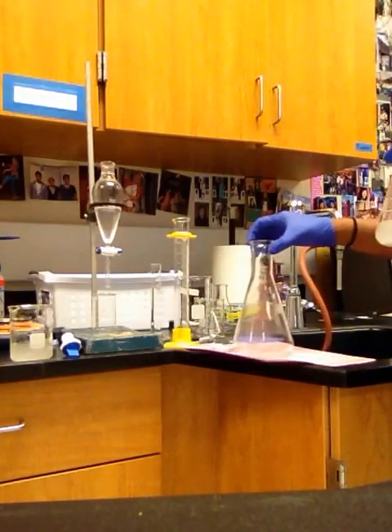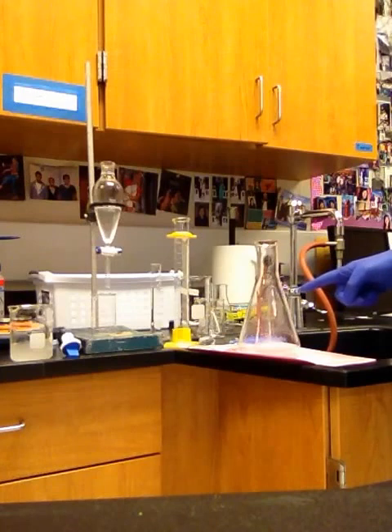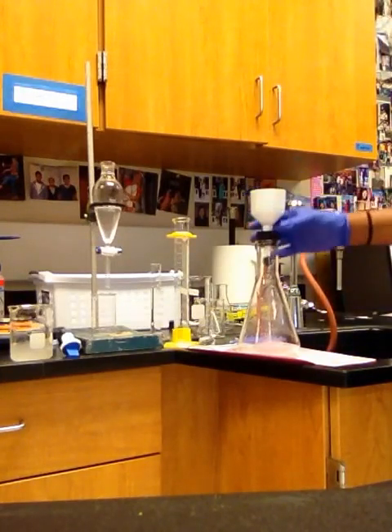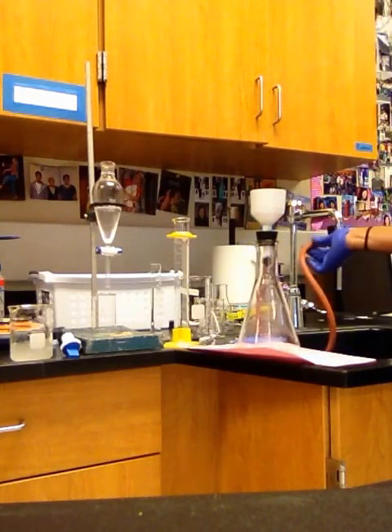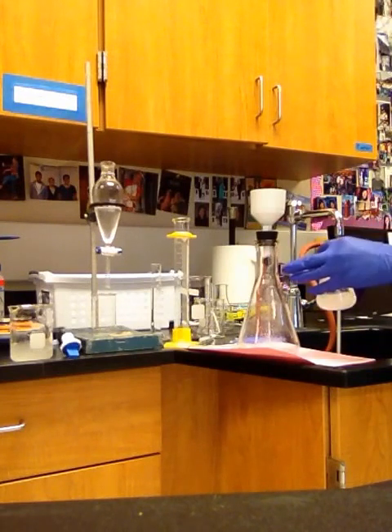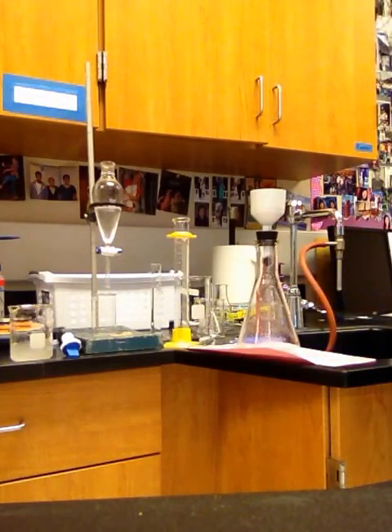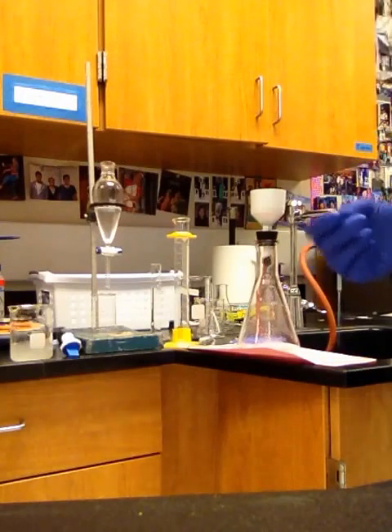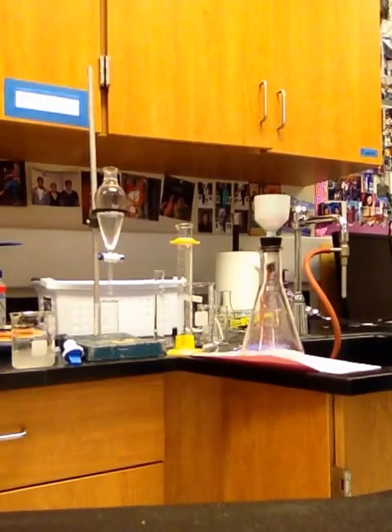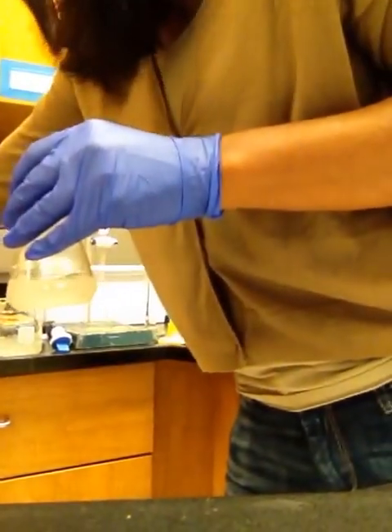For filtration, we use this assembly. It is called a Buchner funnel. A Buchner funnel creates a partial vacuum. So what we do is we put the funnel on top of the flask. The flask is attached to the side arm of the water aspirator, and when you turn on the water, it creates a partial vacuum in here, so it makes the filtration go faster. The only idea of the Buchner funnel is to make filtration go faster. It's just filtration, but enhanced filtration.